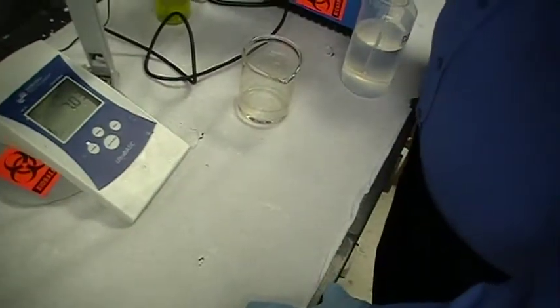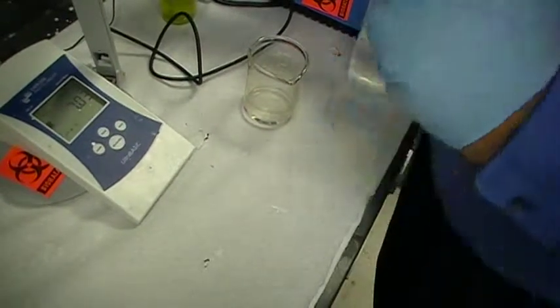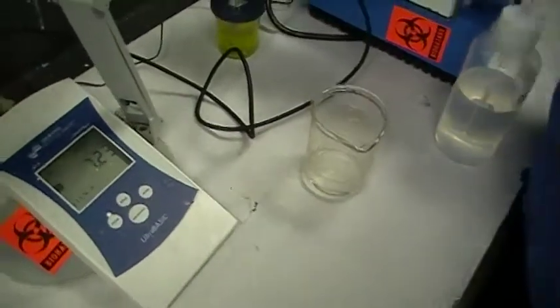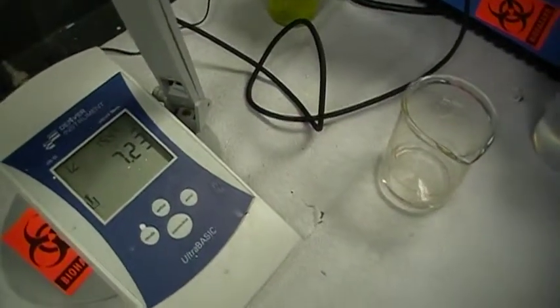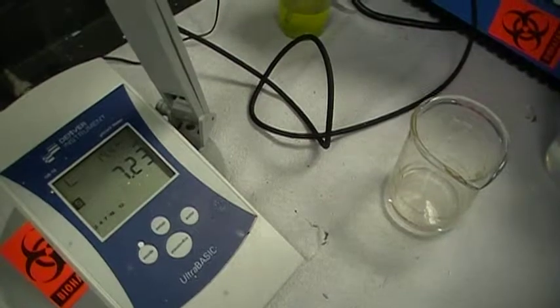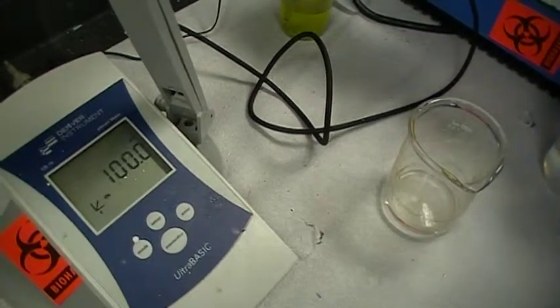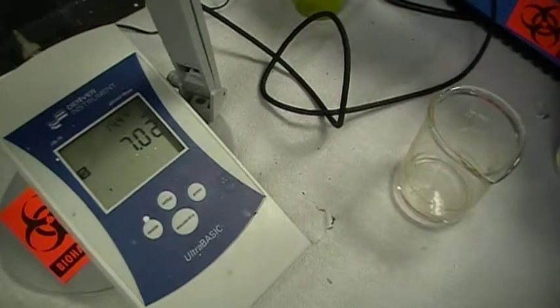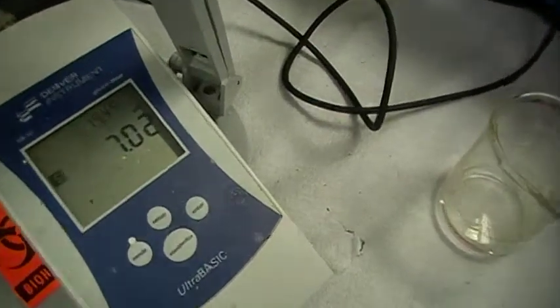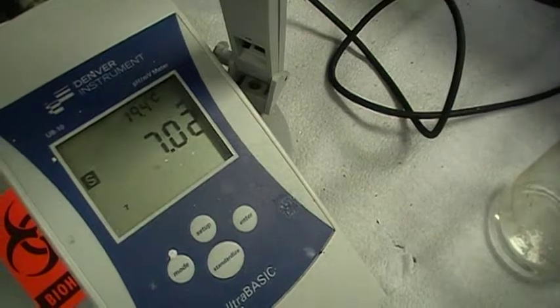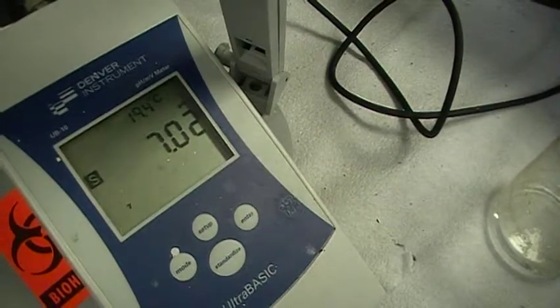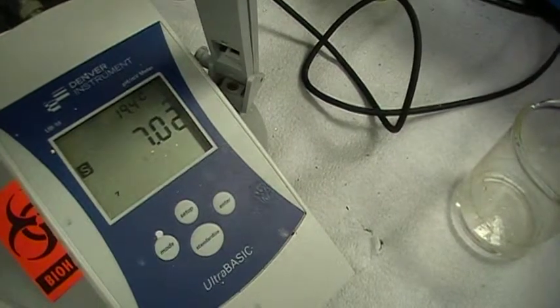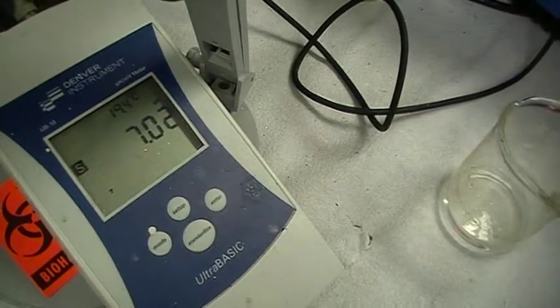And then you press standardize. And you wait. And it's going to read and read. And when the S appears, and when all the numbers stop blinking, and the S appears on the left hand side, it's ready. The pH is 7.02. It's not quite 7 but it's close.